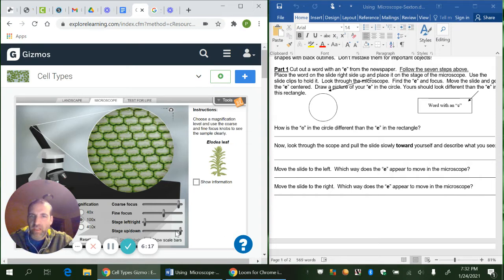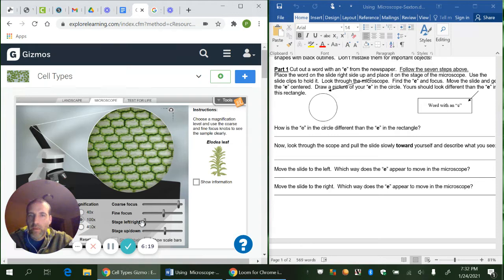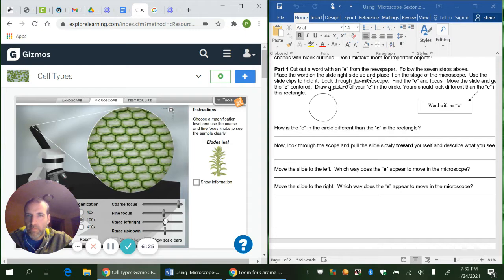Next one says, move the slide to the right. Which way does it appear to move in the microscope? So if I move this to the right, it looks like it's moving left. And that's all you would need to write down. It's just your observation of that. Okay. These questions were really to get you to see that when you're moving things in the microscope, they move the opposite direction.